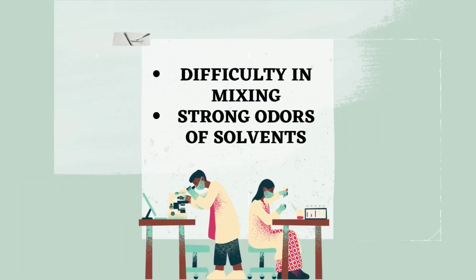Difficulty in mixing. Some samples were hard to mix evenly, especially when dealing with viscous or solid lipid samples, which might have led to incomplete solubility tests. Strong odors of solvents. The pungent smell of some solvents made it uncomfortable to work for an extended period, requiring frequent breaks or work near the fume hood.